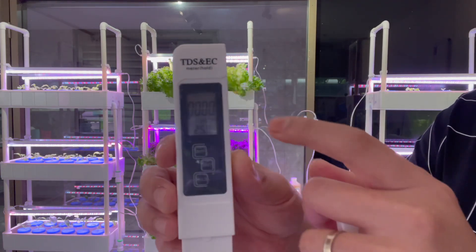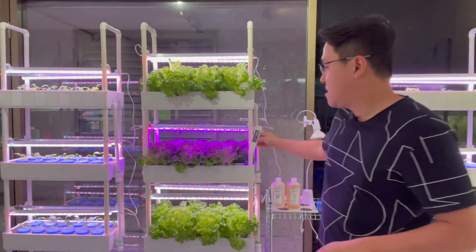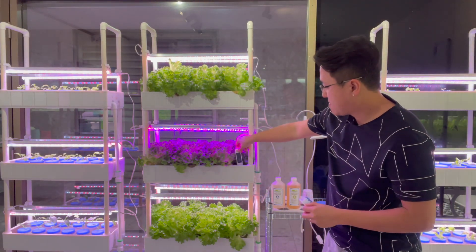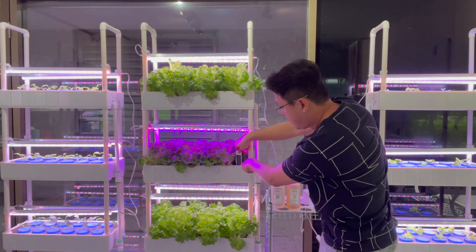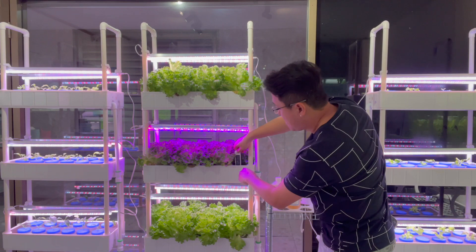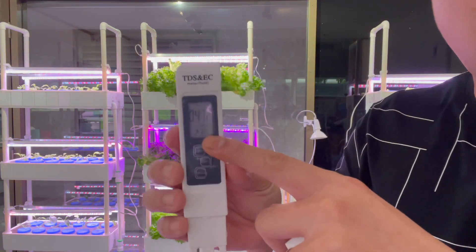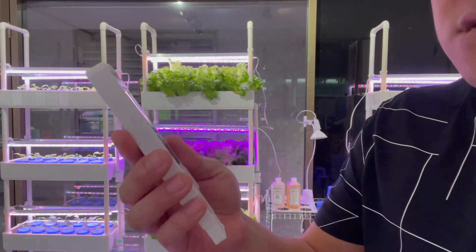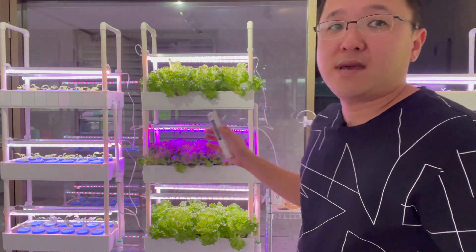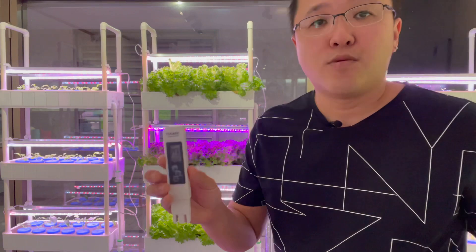Always keep an eye that it's on EC. Then we put the meter into the water — just dip it in. There's another button called 'hold' — hold actually holds the reading. So it's reading 472, which is really, really low right now for this plant. It should be around 1,002.